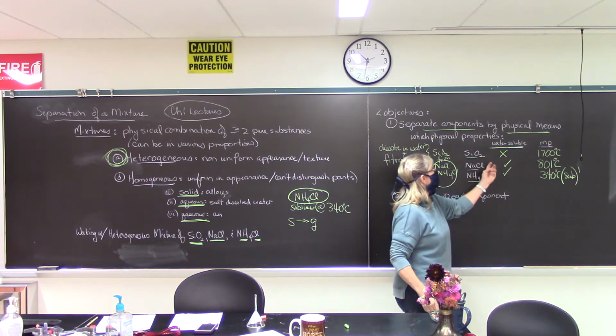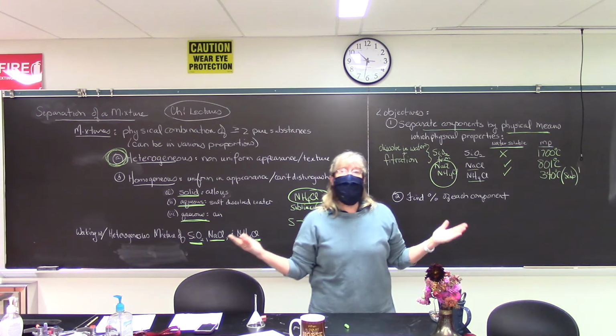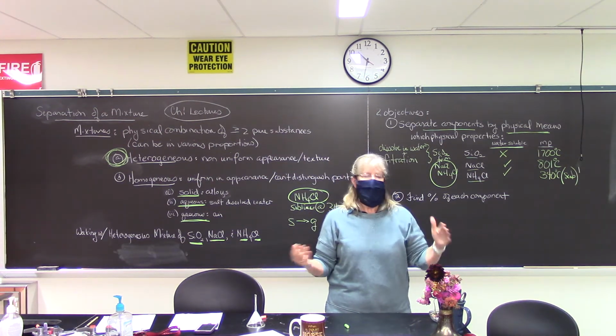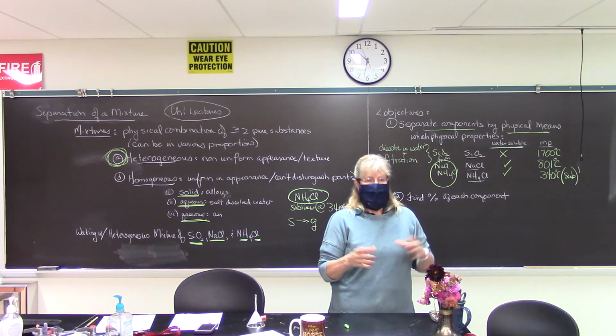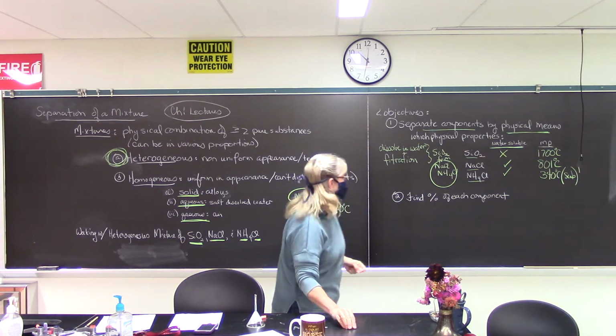Then we're left with just silicon dioxide and sodium chloride. Easy peasy, throw some water in, stir it up, filter it, got nice clean salt water, and we have sand. Dry them up. Why? Well, that's part two.